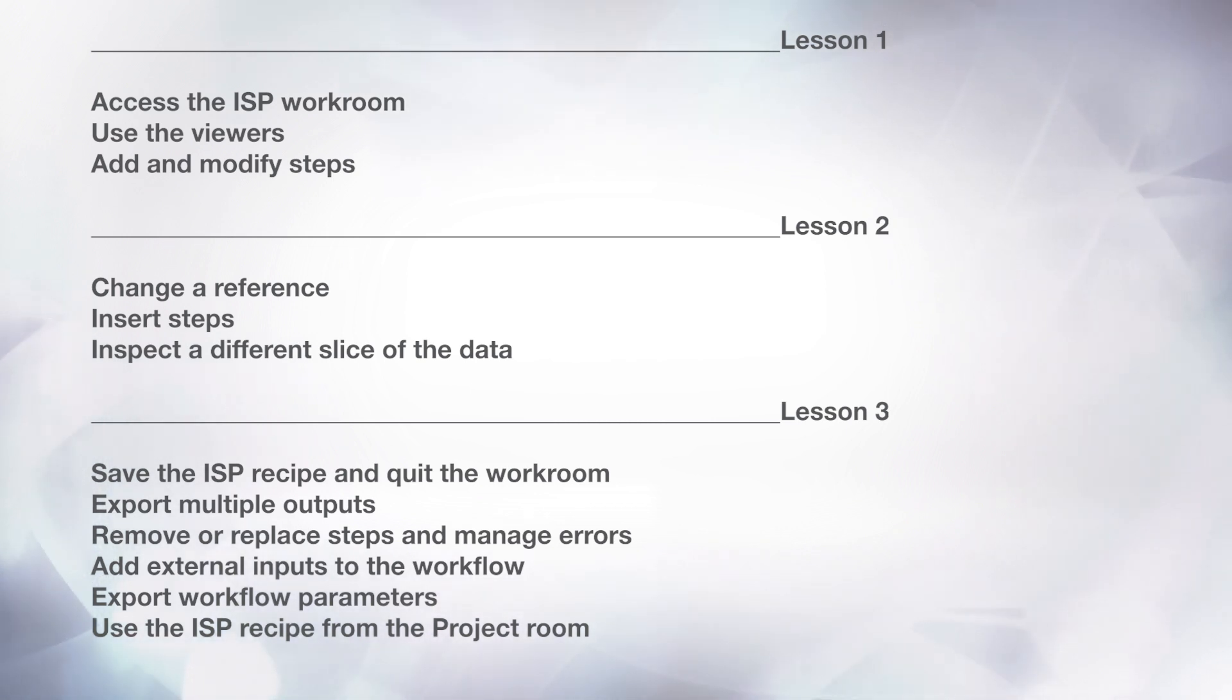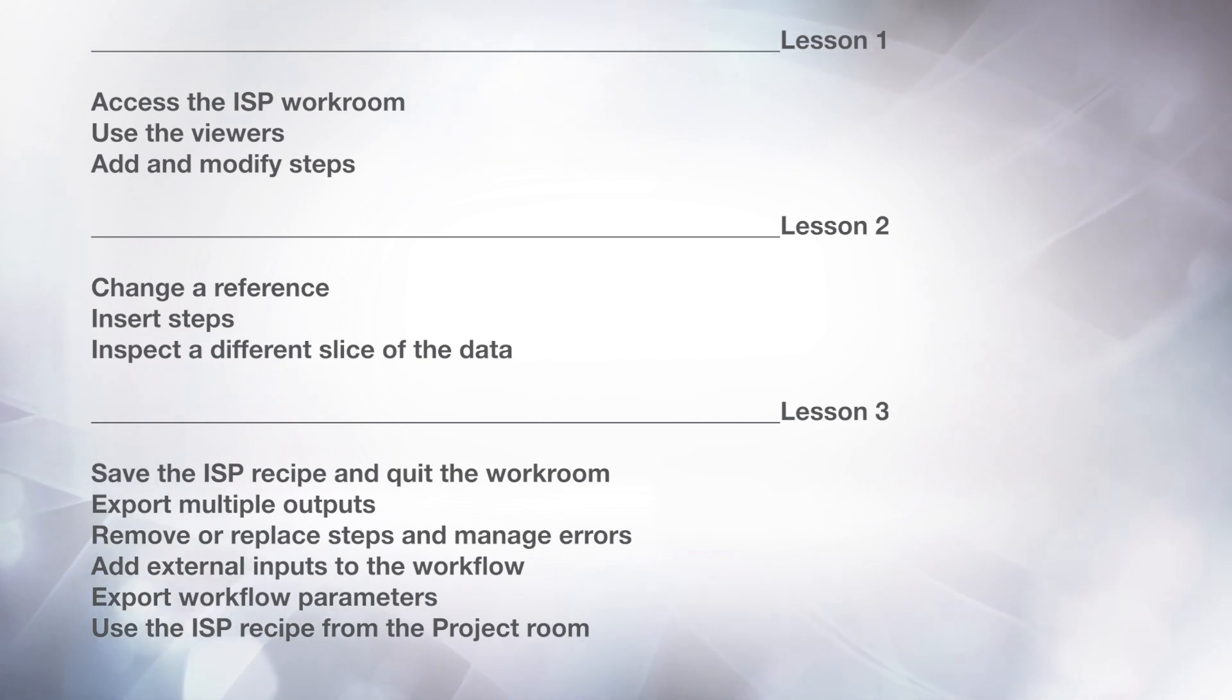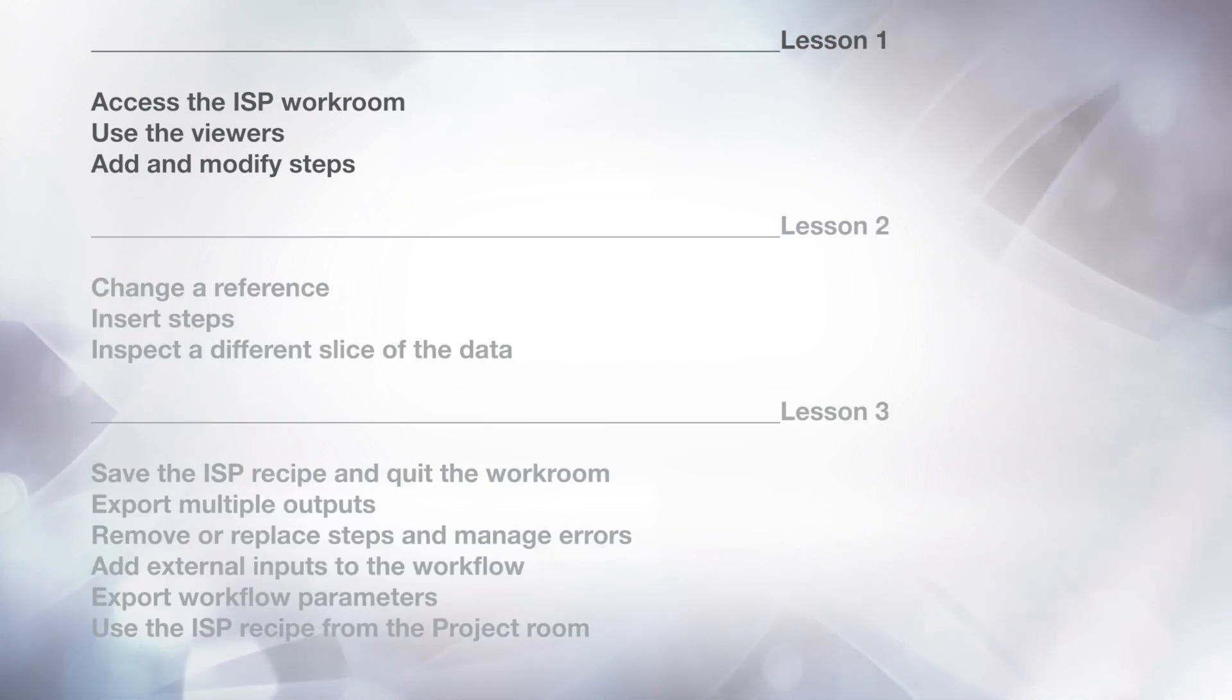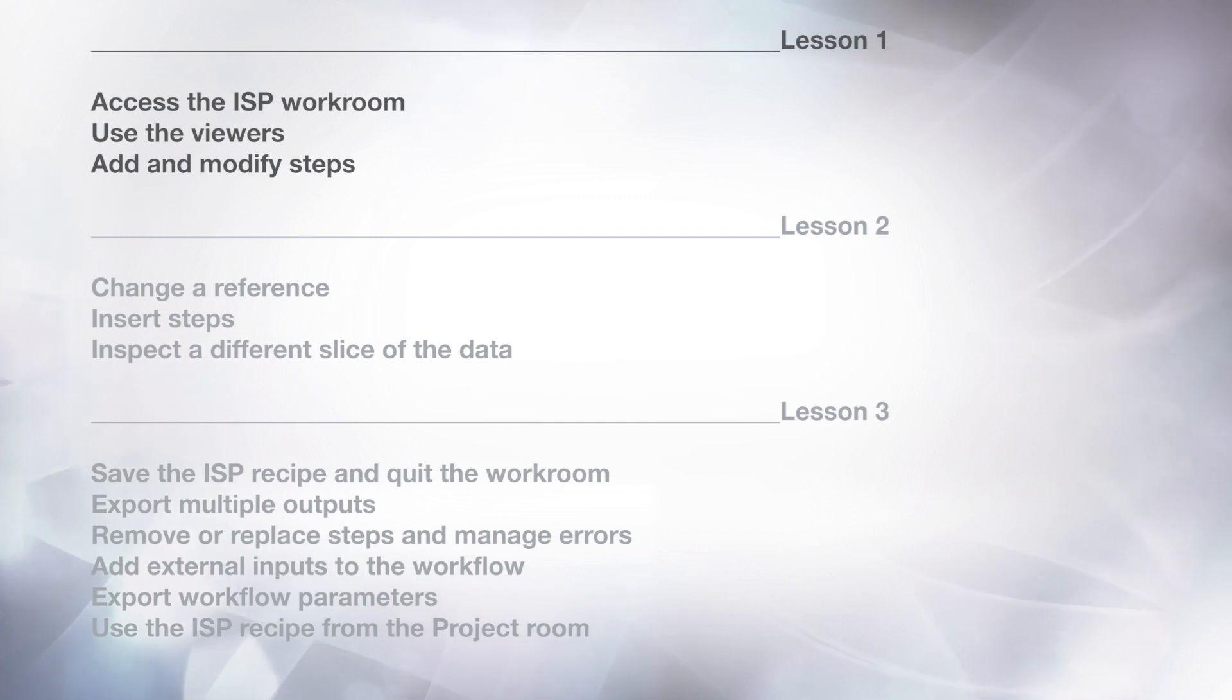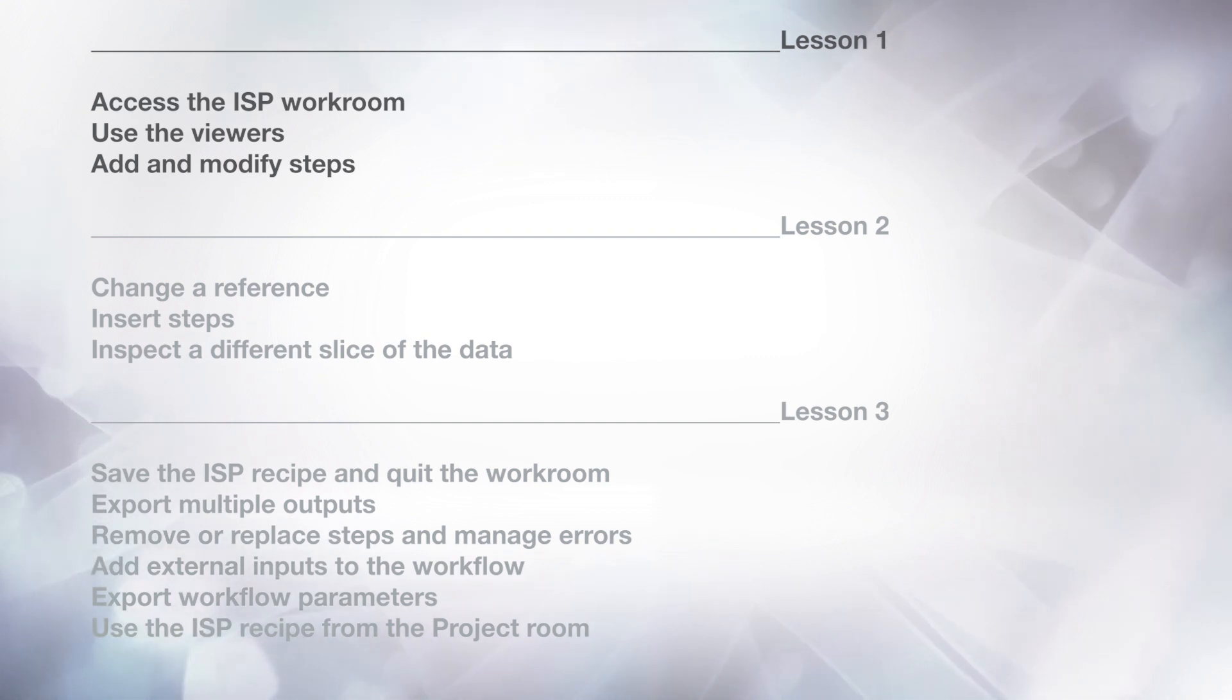In this tutorial, you will learn how to use the Image Stack Processing Workroom and build an Image Stack Processing Recipe. This tutorial is split into 3 lessons. In the first lesson, you will learn how to access the workroom, use the viewers, add and modify steps.